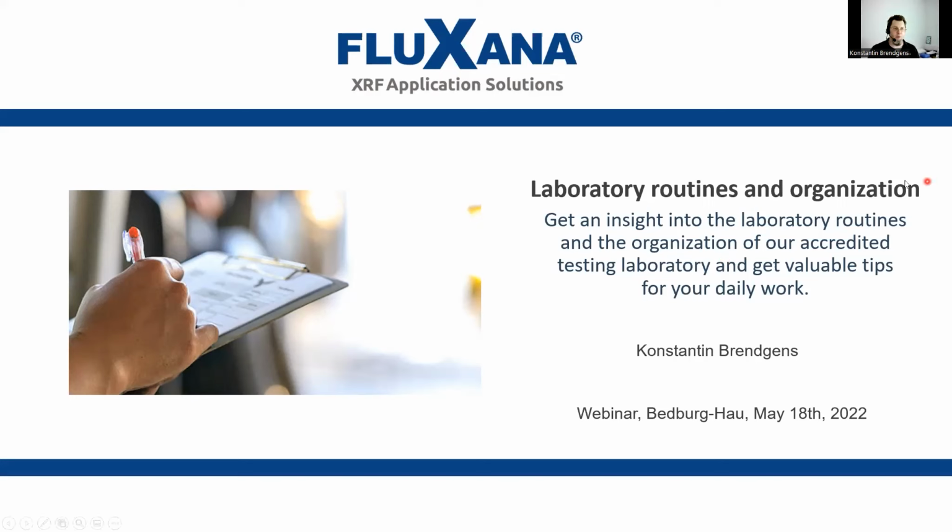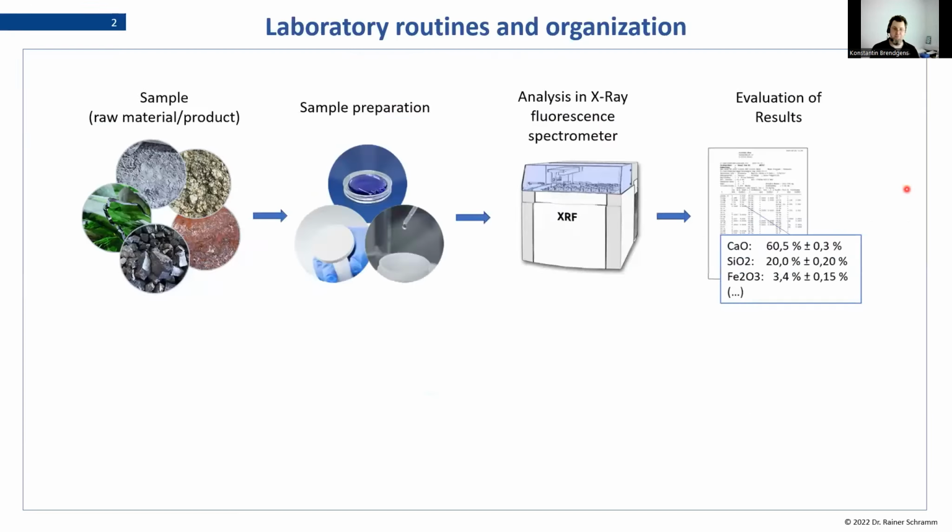And we will share a bit of how we at FLUXANA do it, with the focus here being that we have the ISO 17025 accreditation. So a lot of that is covered in this norm, and we have to follow the rules set by it. But of course, there are also a few practical tips here that you can apply to any laboratory, regardless of the accreditation status. So let's go into the presentation and have a look.